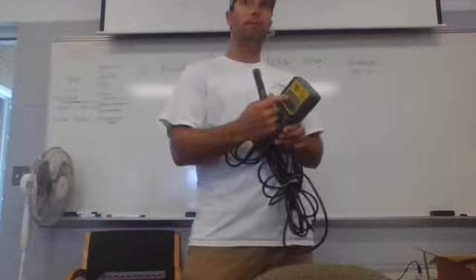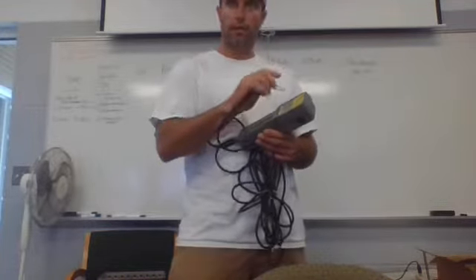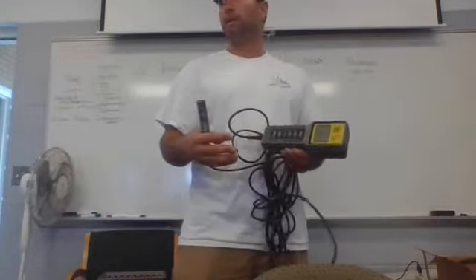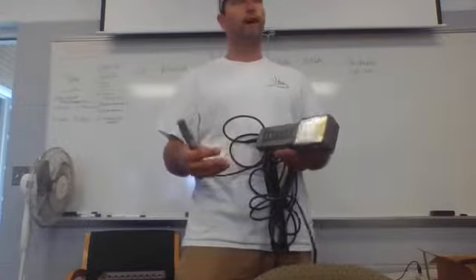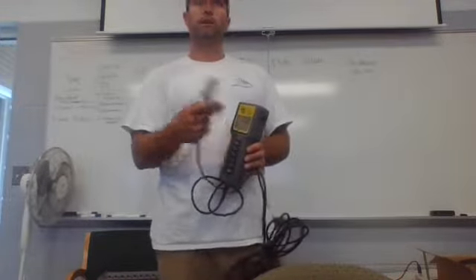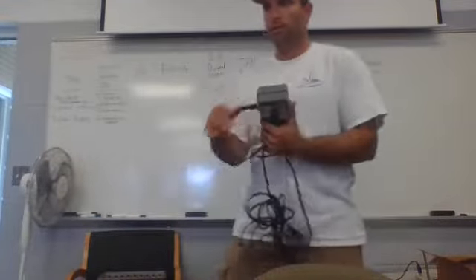It also measures temperature, so it can do that compensation for you. And you can either measure the straight conductivity or the temperature compensated conductivity, which I think 25 degrees is sort of the standard. And it'll also convert it to salinity for you. So this is a meter that measures all three.